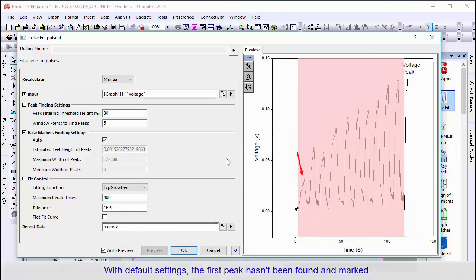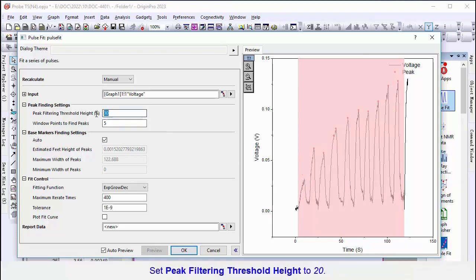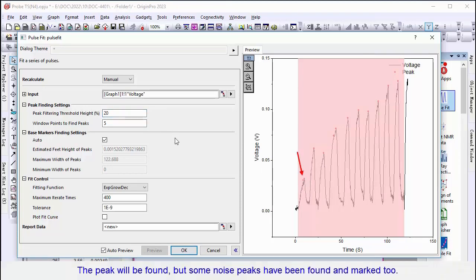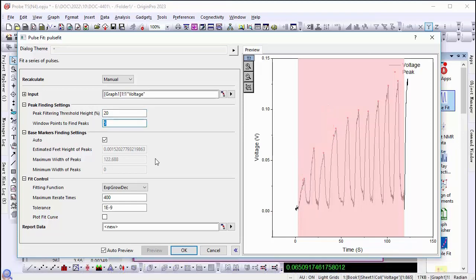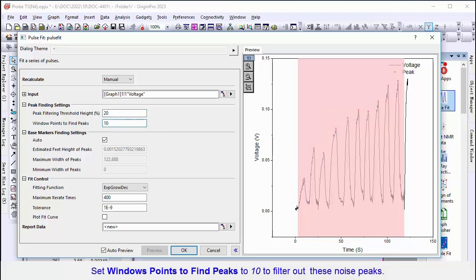Set the threshold height as 20, but you will find that some noise peaks have been found too. Set Windows Points to Find Peaks to a larger value to filter these noise peaks.